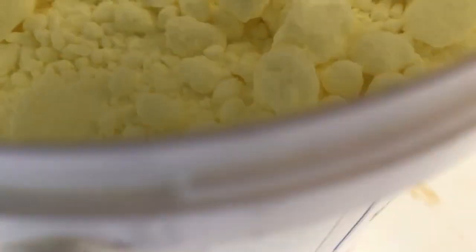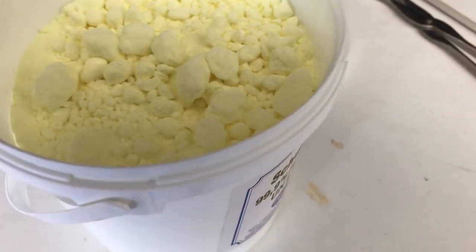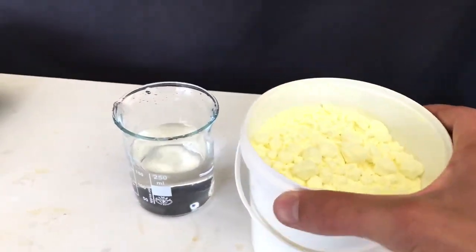Welcome back everyone. Today we are going to explore different allotropes of sulfur. For this you are only going to need sulfur and a beaker of water.